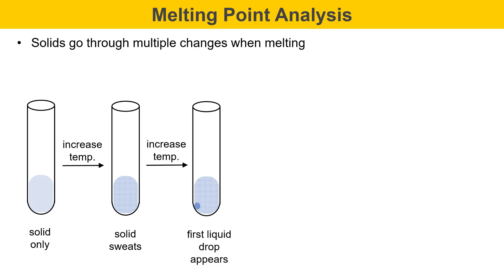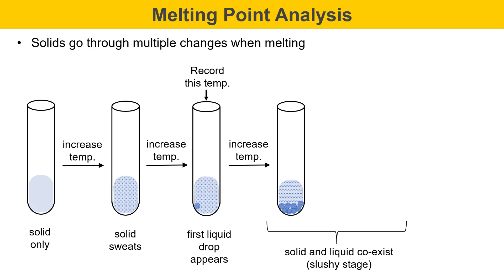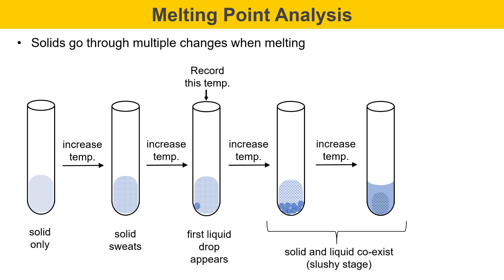You should record this temperature as the first temperature of the melting point range. Then, as temperature is increased, you get to a point where the solid and liquid coexist in a slushy stage. At one point, there might be multiple drops of liquid, or the solid might be sitting in a little puddle of liquid. As the temperature is increased further, the remaining solid is completely immersed in liquid.